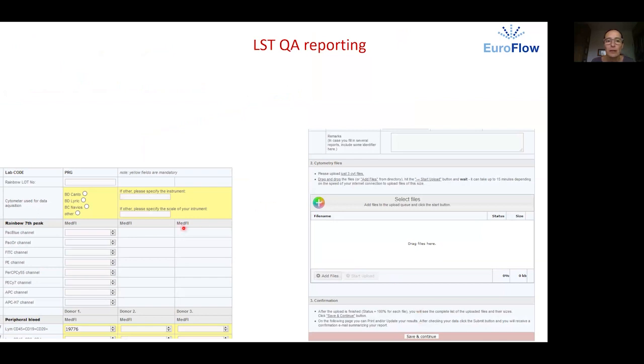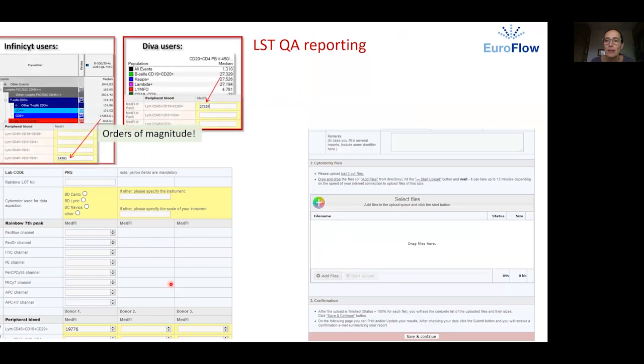When filling in the numbers into the report form. Be aware that Infinicyt uses decimal point to separate the whole numbers and diva uses comma to separate thousands. So while this is 163 in Infinicyt this is 27329 in diva. Often we find that you report means instead of medians because they are as a default there.